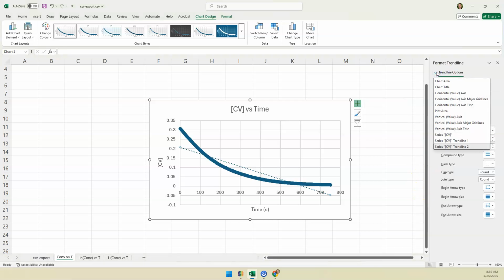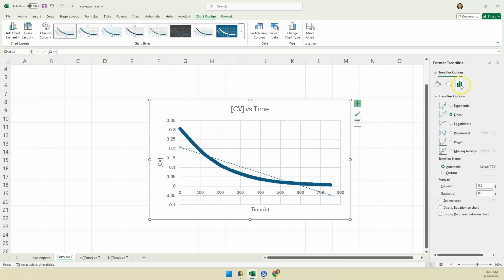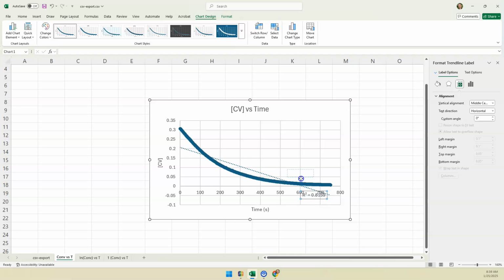And there should be a way to get our, here it is. So if you go over to the graph, down at the very bottom, it says display R² value on chart. If you click on that, that will tell you how close it is to being a straight line. So if your R² value is 1, that's a straight line. If it's not 1, or it's not close to 1, it's not a straight line. So the closer you are to 1, the closer you are to being a straight line. And you can use that R² value, excuse me, to argue which graph is correct.